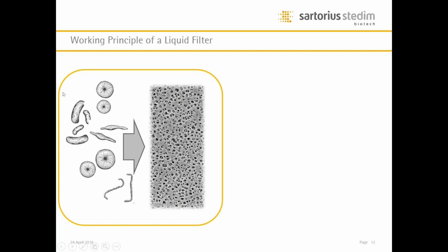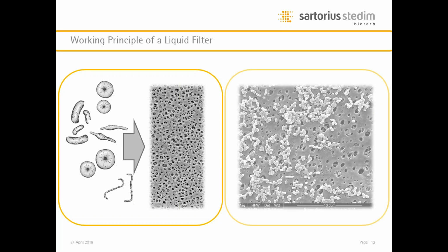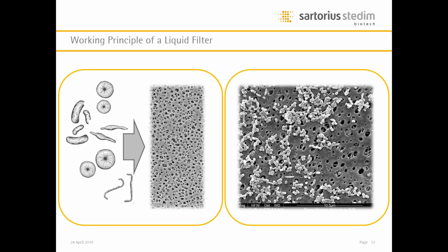And for such small organisms like bacteria here, you see it's not a pore with an ideal pore size, so you cannot really measure it and you will always get 0.2, but it's more a statistical approach. And how a sterilizing grade filter is qualified, I will touch this point in a few minutes. So very important, this is a real picture of a polyether sulfone membrane, challenged with some microorganisms, Brevundimonas diminuta, during a test that we call bacterial challenge test.